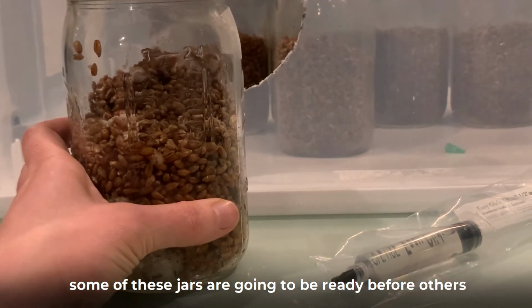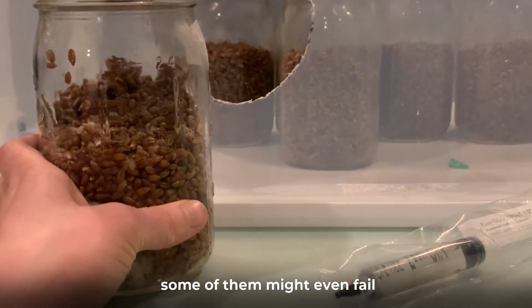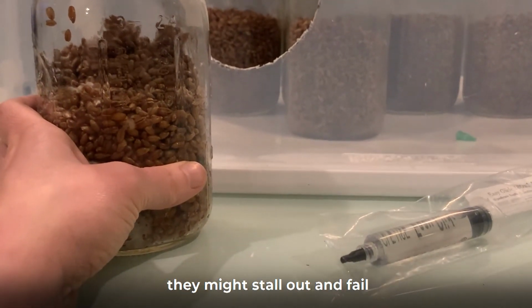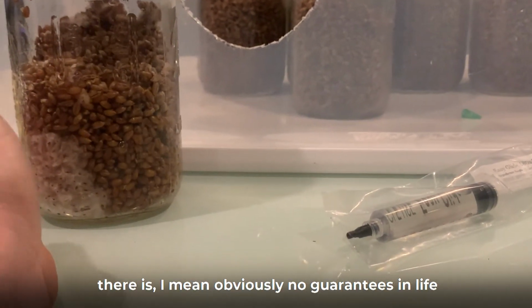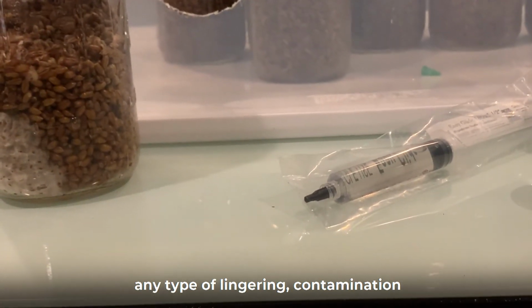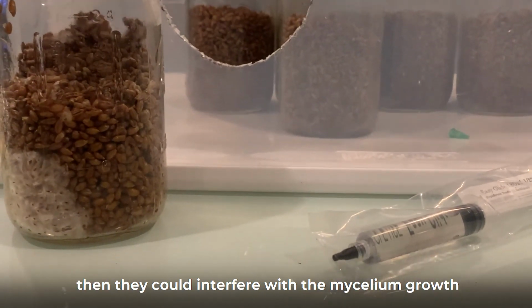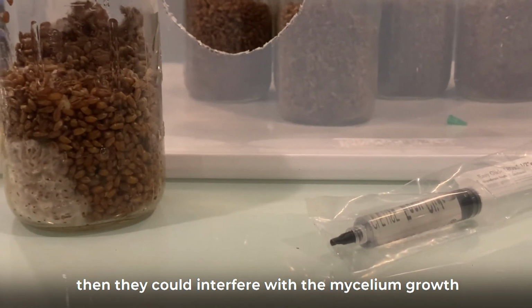Now, because we've inoculated these jars with spores, we're not necessarily going to get even growth. Some of these jars are going to be ready before others. Some of them might even fail. They might stall out and fail. There's obviously no guarantees in life. Any type of lingering contamination or bacterial growth or yeast growth in there could interfere with the mycelium growth.